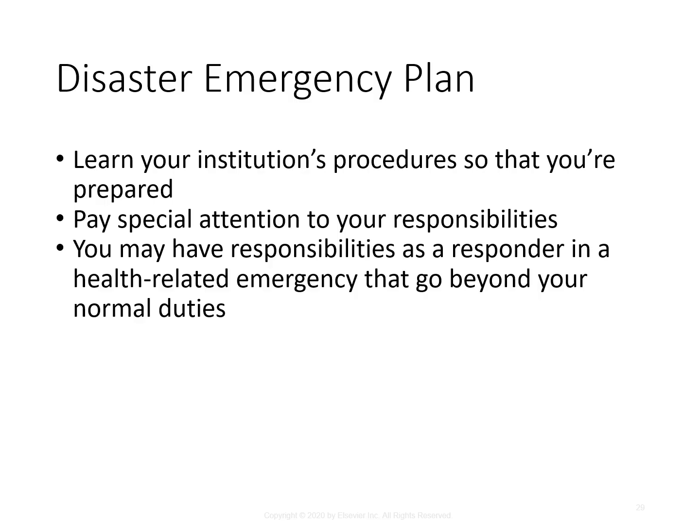So make sure you pay special attention to what your responsibilities actually are and know what to do in those types of situations, because when a disaster does happen, it gets a little chaotic. And when things get chaotic, it's kind of hard to remember what you're trying to do if you don't really know what you're supposed to do in the first place. So make sure that you know what those responsibilities are and have a plan in place.